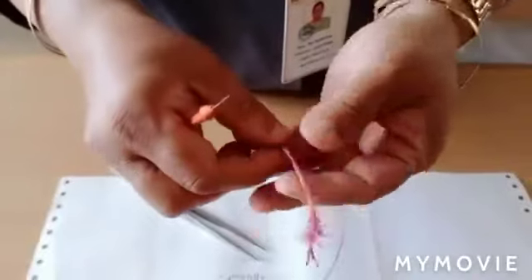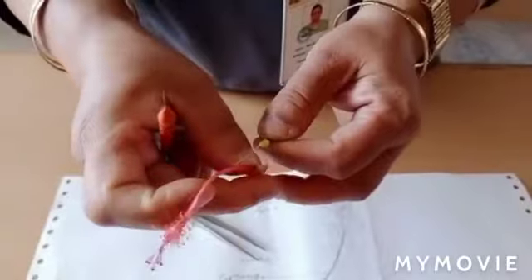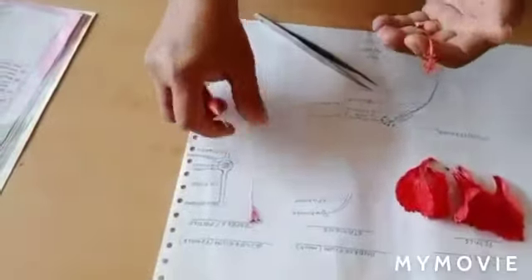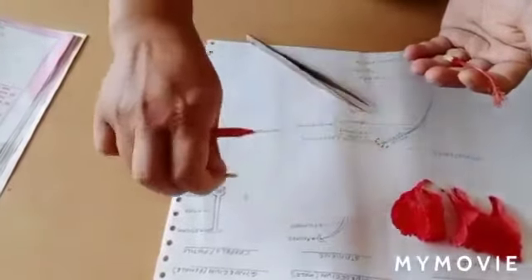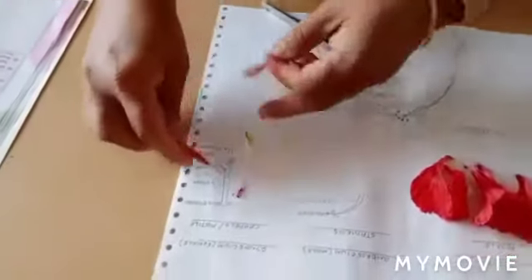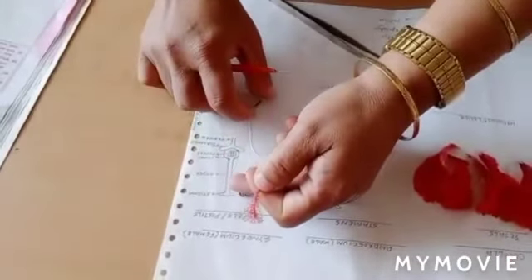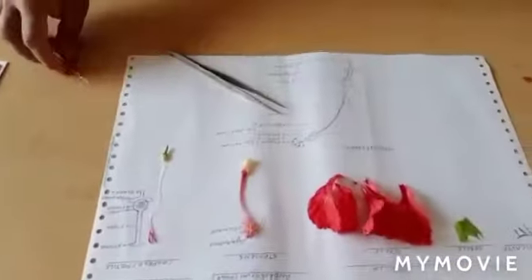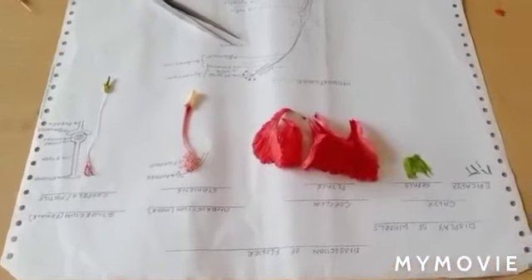So this way we should separate the gynoecium and the stamen. Yes, this is how we dissect the given flower into its whorls.